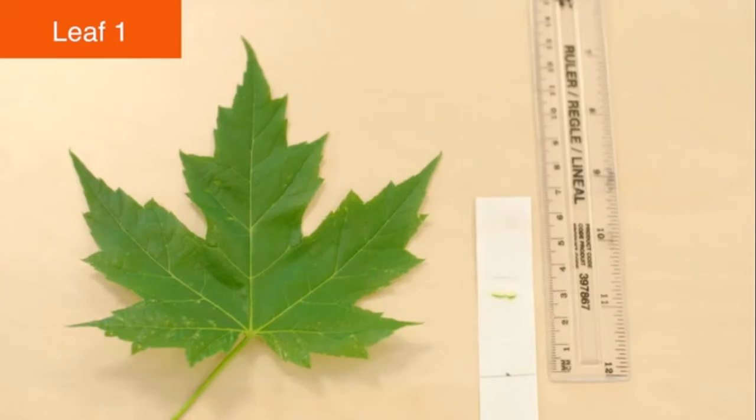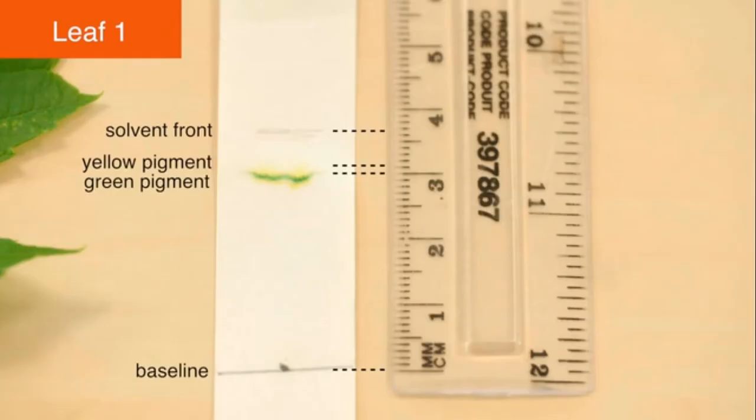The number and color of any pigments is recorded in the results table. A ruler is used to measure the distance travelled by the solvent front from the horizontal pencil line. This is recorded in the results table. The distance travelled by any pigments found on the strip is also measured and recorded in the results table. These two values can be used to calculate the individual retention factors for each pigment.